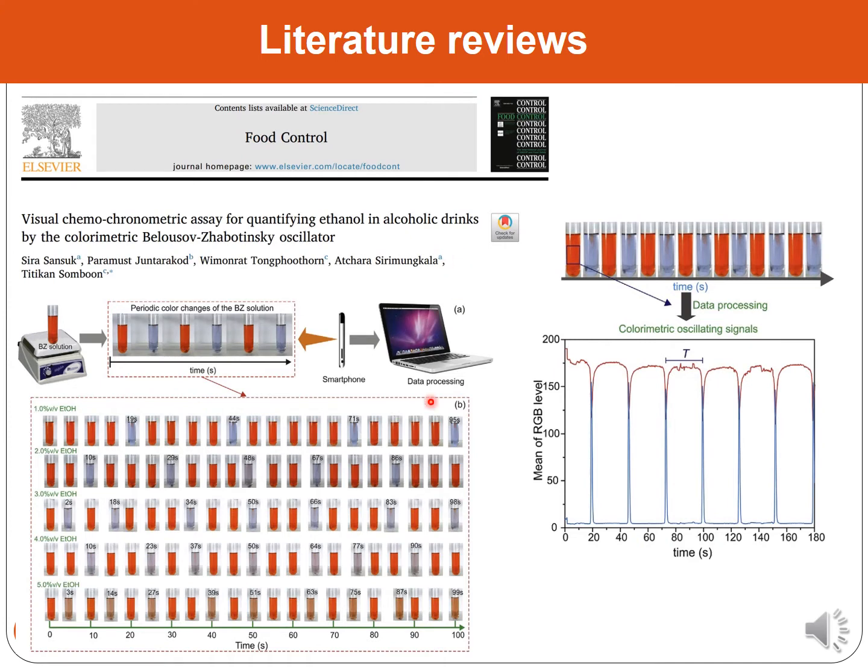And also based on oscillation, the colorimetric oscillating signals, COS, obtained by data processing can be successfully used for determining ethanol in alcoholic drinks. Although the two phenomena in the BZ reaction can be successfully used, in this work we would like to present the investigation of the advantages, disadvantages, and limitations of both methods compared to gas chromatography, which is a high-class technique.